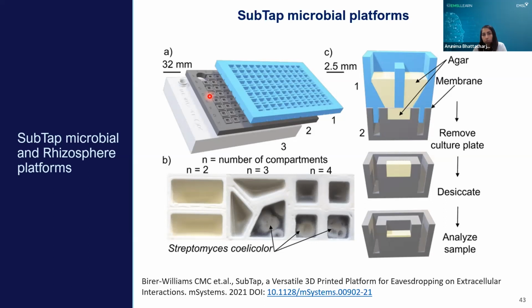This is extremely high throughput. It is in the configuration of a 96 well plate. And the interesting thing is that you can print these in any kind of configuration.